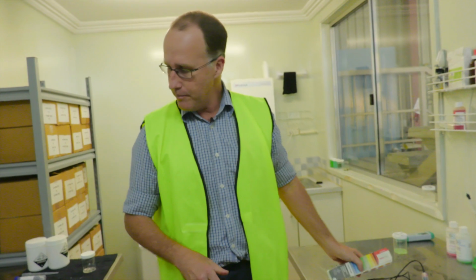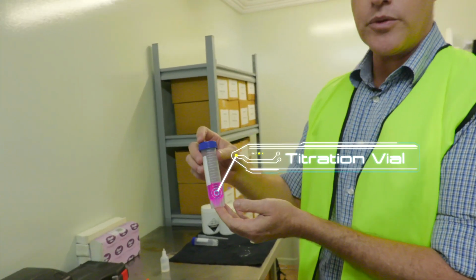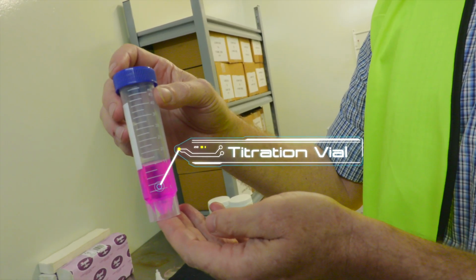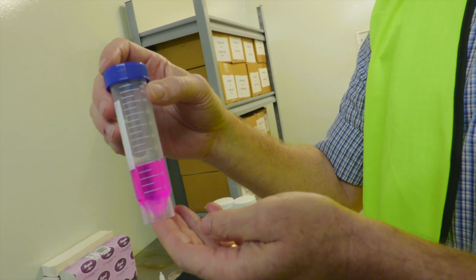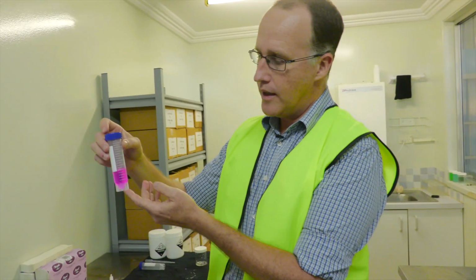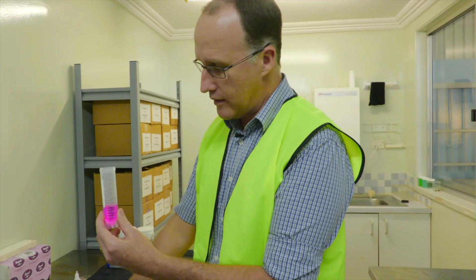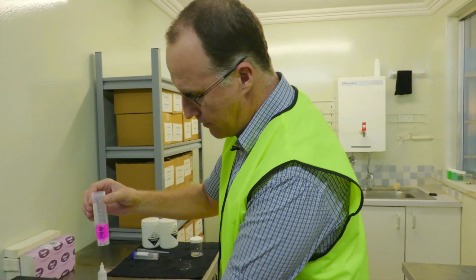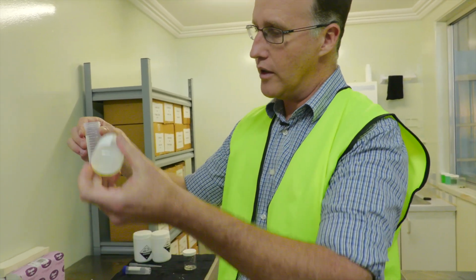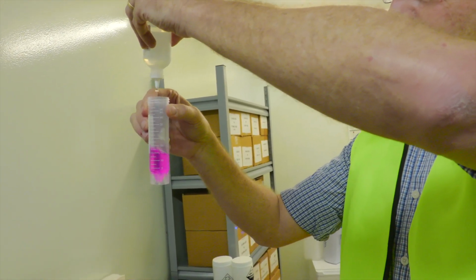Over on this side of the lab, we've got a little titration set up. So sometimes when we're out in the field or when we're making a product in our factory, we need to take the pH step further than just measuring the pH, and we use this type of titration. This one will be an alkali product, and we put a bit of an indicator in there to make sure that we can see the colour change. We choose the correct reagent and just slowly dropwise add it to the parent solution and mix it until the colour changes.